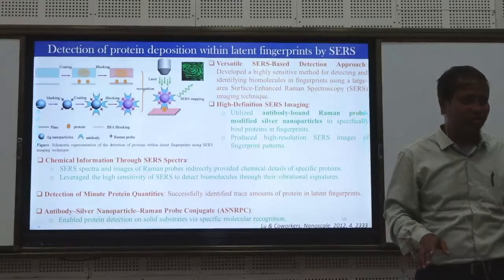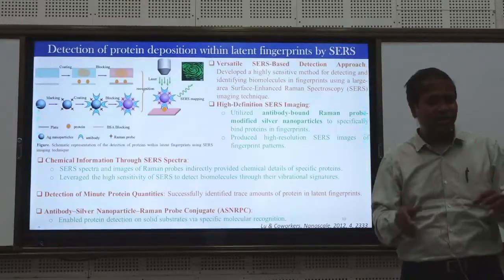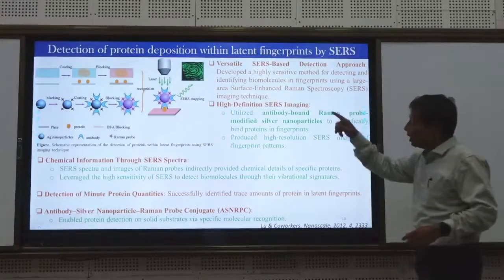Only thing is that we don't care about analysis. We just want to have a very clear Raman spectrum and then only we say something. But analysis is a very important aspect of Raman spectroscopy.